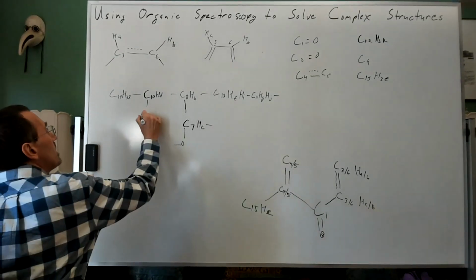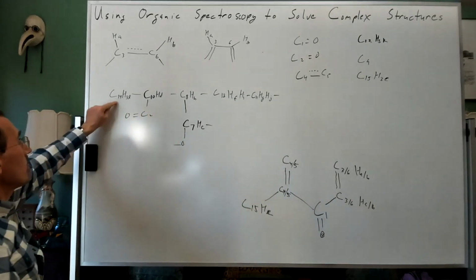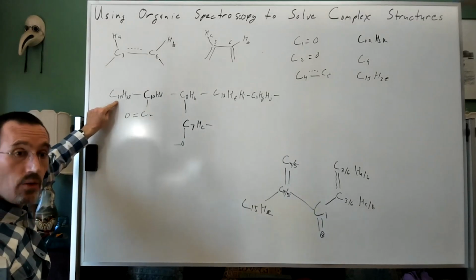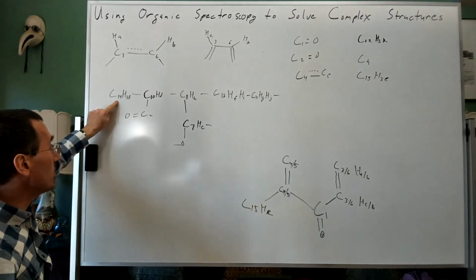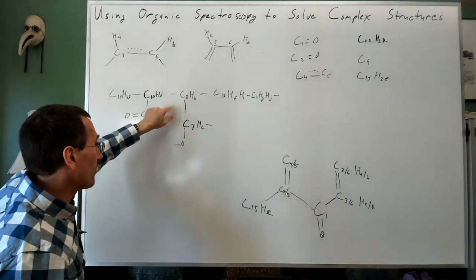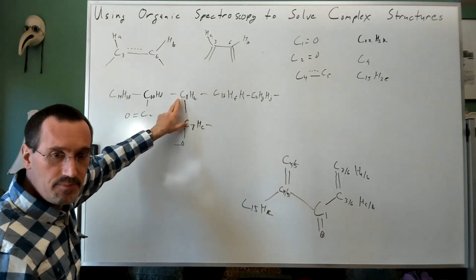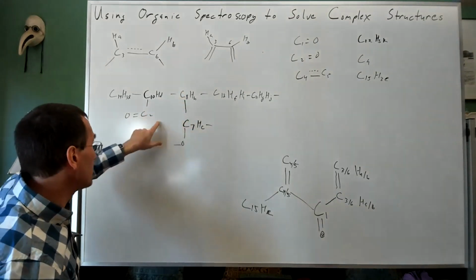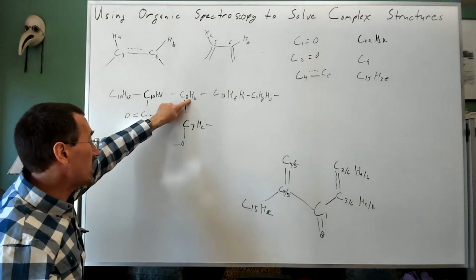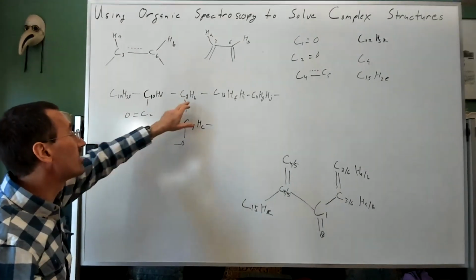So here's carbonyl number 2, right? It can't be directly attached to 14L. We're picking up our J2 and J3 CH coupling. To use James's favorite expression, the absence of evidence isn't evidence of absence, particularly in the case of a methine where you have dihedral angles. But for a methyl group, it probably would be evidence of absence.